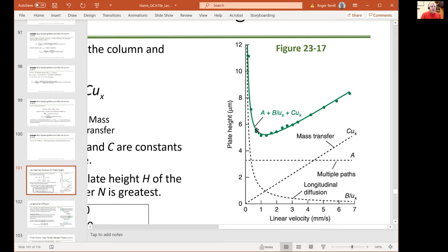So anyway, this is just to say that the difference between HPLC and UPLC is just where you are on this column, where you are on this curve, right? HPLC is up here and UPLC is down here, right? So we're getting closer to an optimum, but we really can't pump that hard yet. But in GC, we can. In GC, you can go right past the optimum, right?